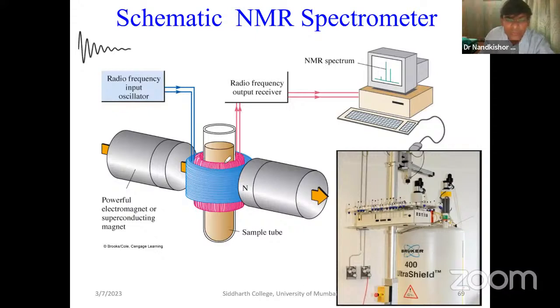When the tube spins at a certain RPM, the solvent inside containing the compound, having a proton, carbon, fluorine or phosphorus, depending on which technique you are looking for. If such nuclei are in the sample, when it spins, each nucleus acts as a bar magnet.